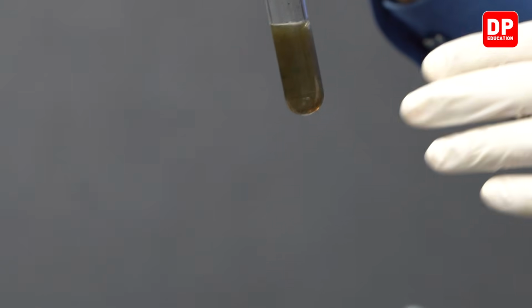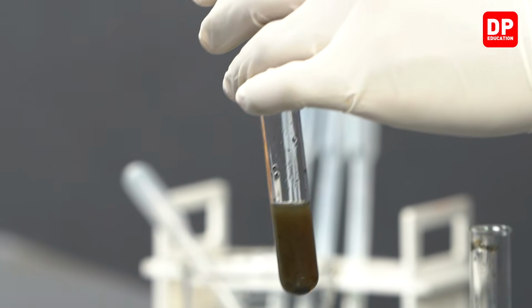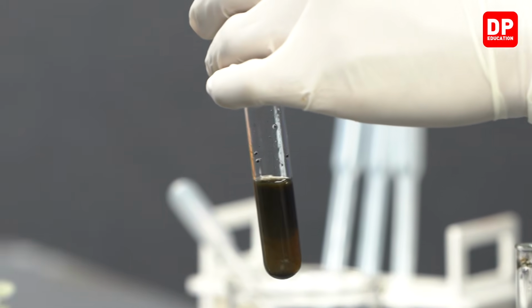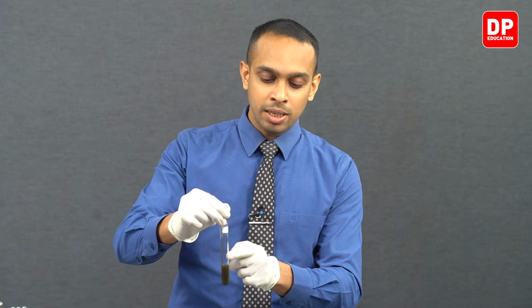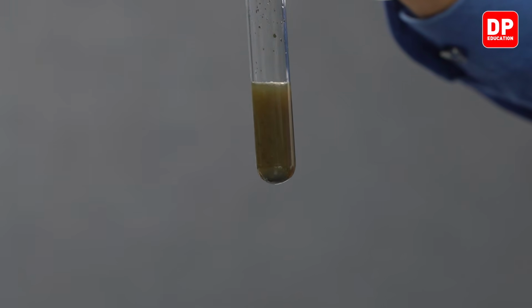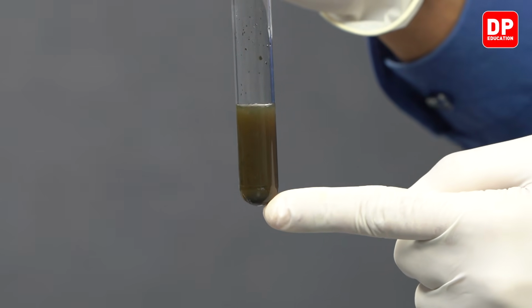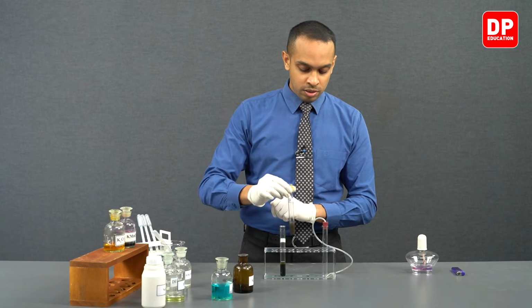You can see this black color precipitate gets dispersed, and if you add a few more drops of silver 1+ ions, you can observe the black color precipitate that is formed very clearly here. You can see some black color precipitate particles coating the walls of this test tube as well, and black color silver sulfide precipitate will after a while get collected at the bottom of the test tube.